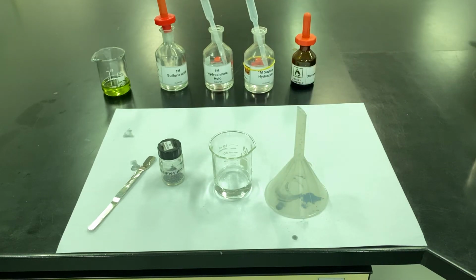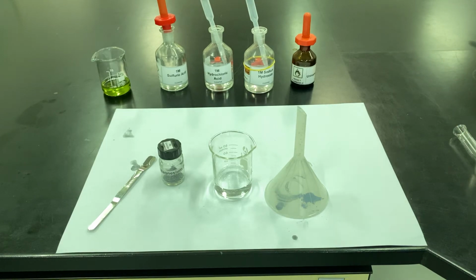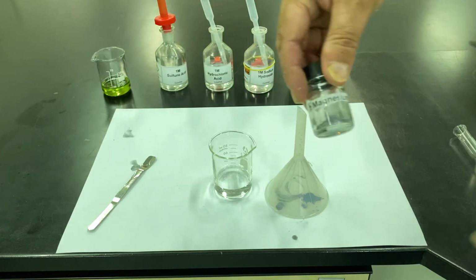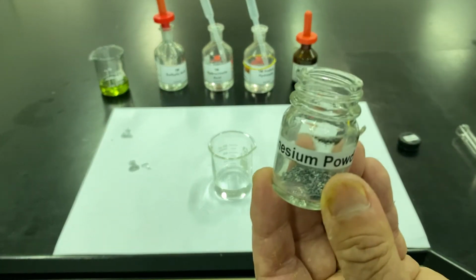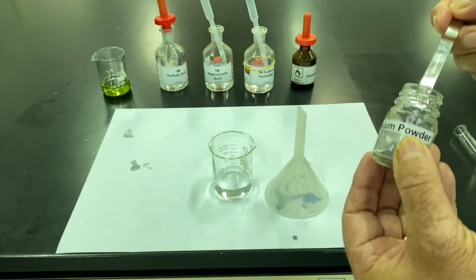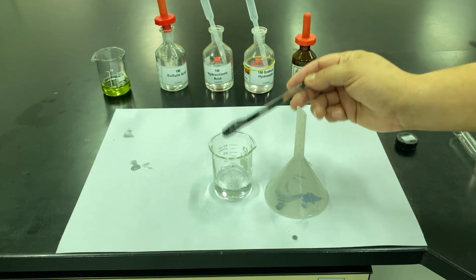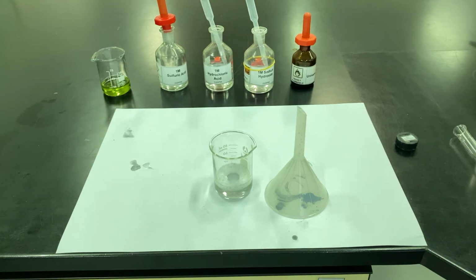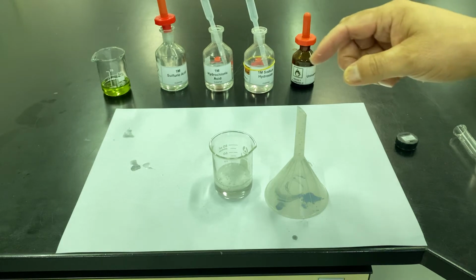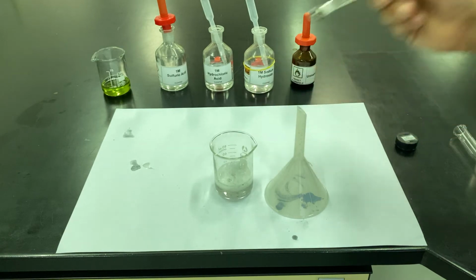Okay, so we use a filter funnel. Now the reason is, the gas is hydrogen gas. And the way we can test that is with the famous Squeaky Pop Test. So let's have a go. So this says magnesium powder, but this is little turnings of magnesium. Okay, so let's see how vigorously this reacts. So as you can see there, bubbling away. Now the reason it's bubbling away is because there's a chemical reaction taking place. Now that chemical reaction is producing hydrogen gas and a salt.